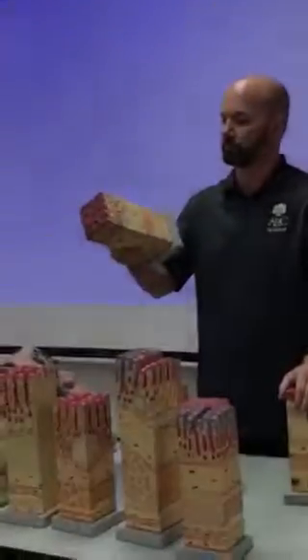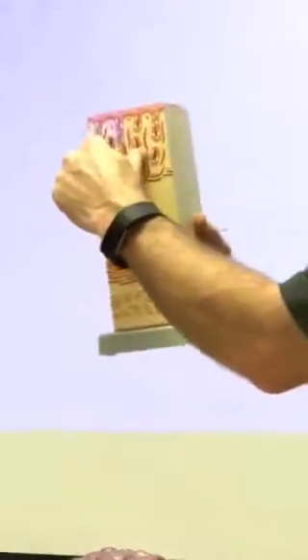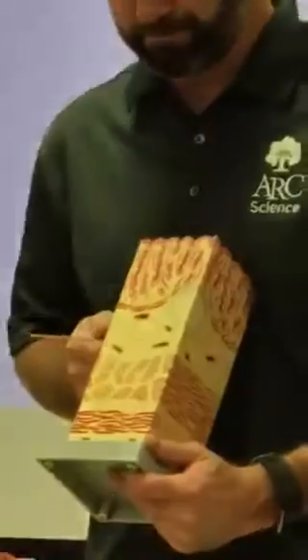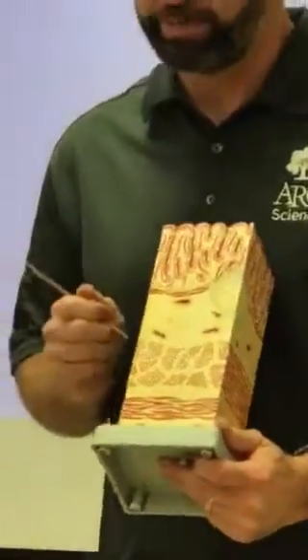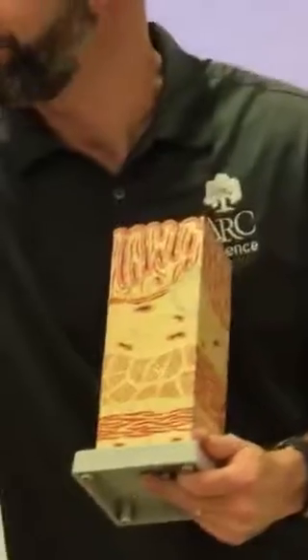Flat, has serosa, only 2 layers of muscularis externa, can't be stomach, no villi, can't be small intestine. Simple columnar epithelium, can't be esophagus, colon, large intestine. The white cells, goblet. There should be, by the way, and there isn't, way more goblet cells on this model than the small intestine. That is a difference between large and small. Large has way more goblet cells.